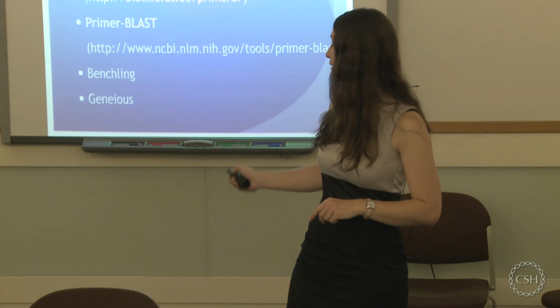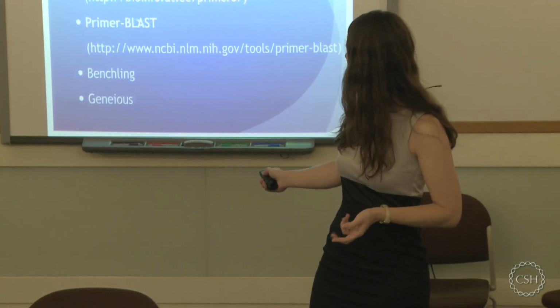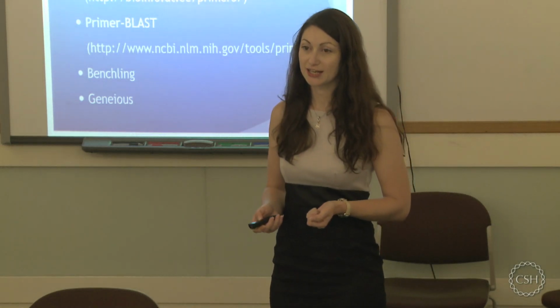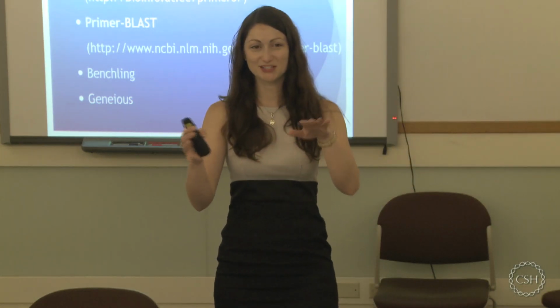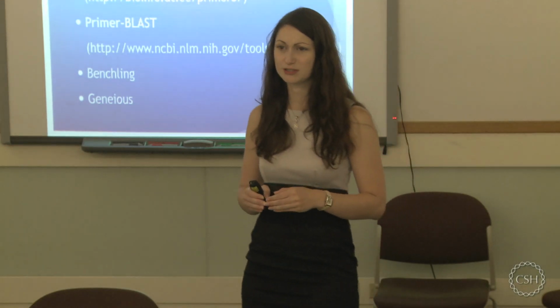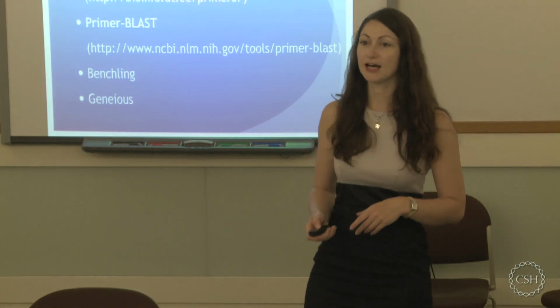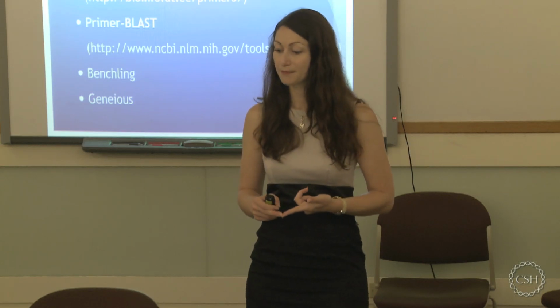There is also a web-based surface called PrimerBlast, and PrimerBlast is NCBI based. It just combines Primer3 software with a blast search. So that's also quite handy. I use it a lot because I'm working a lot with pseudogenes, so I need very specific primers, and you just copy-paste your sequence there. You have to adjust the length of the amplicon because by default it's, I think, 100 to 1,000, and that's too long for qPCRs at least. But otherwise it's really good, and it will give you not only primers that work, but also primers that are specific to your transcript right away.